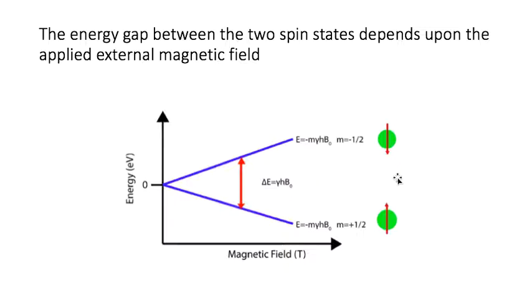And this is why when you go and have an MRI scan, which is a form of NMR, nuclear magnetic resonance, the magnets are gigantic because they're trying to get the best resolution they possibly can so they can see more details of what's going on. So big magnets for this technique.